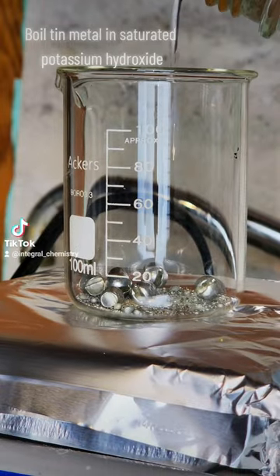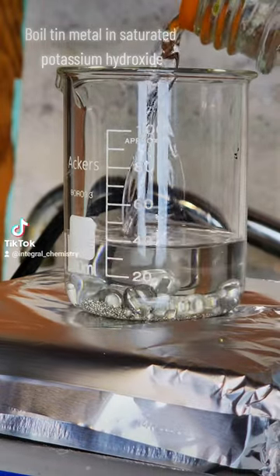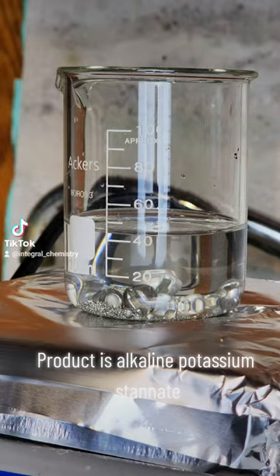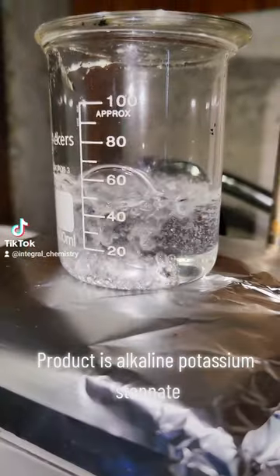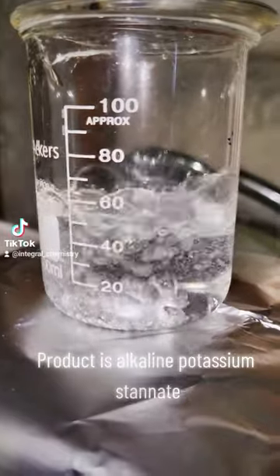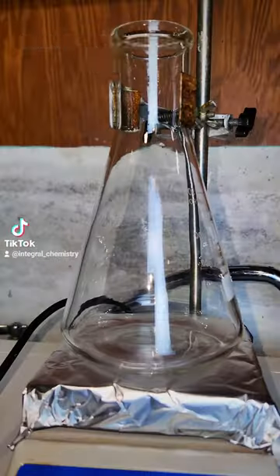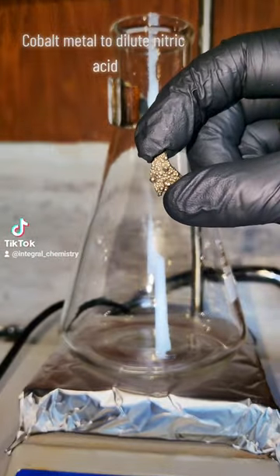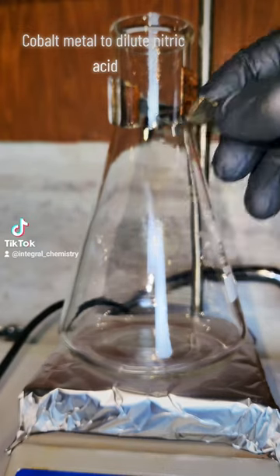To begin the synthesis, I need to make potassium stanate by boiling tin metal in a saturated potassium hydroxide solution. Technically, sodium hydroxide might be able to work as well, but the formula I found used potassium hydroxide.